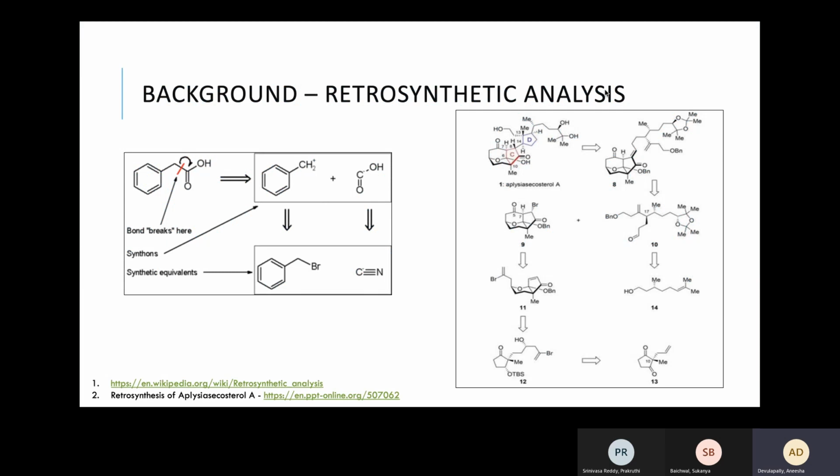During the drug development process, after a candidate has been identified as a potential drug, satisfying all necessary properties and conditions, the next important step is to manufacture or synthesize it. This requires chemists to determine the synthesis plan. Retrosynthesis or retrosynthetic analysis is one technique for identifying a required synthesis plan for such a candidate molecule. This slide shows some examples of the identified retrosynthetic plans.